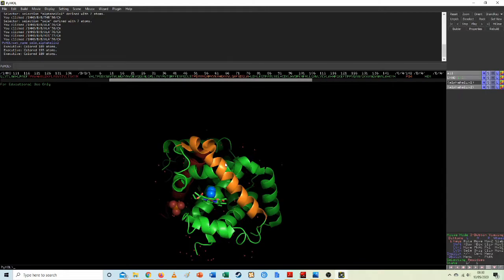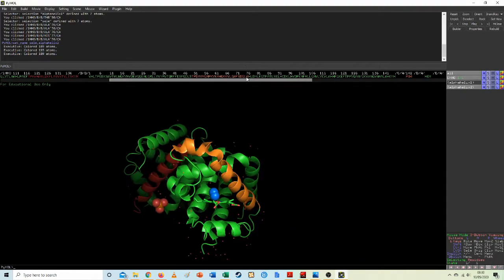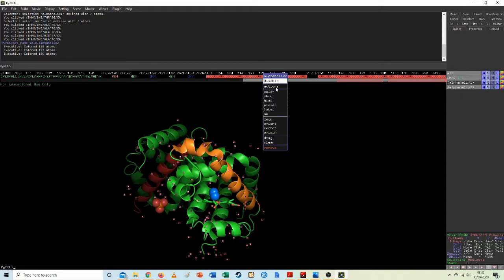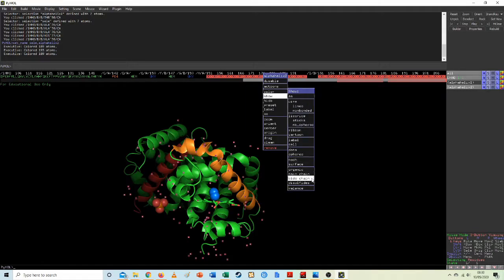Now, what I wanted to do was show you the water molecules. If I have taught you before, you have probably heard me mention a few times that you are a watery bag of protein. And that water is really important because the water is going to interact with our protein, and it's going to form bonds.